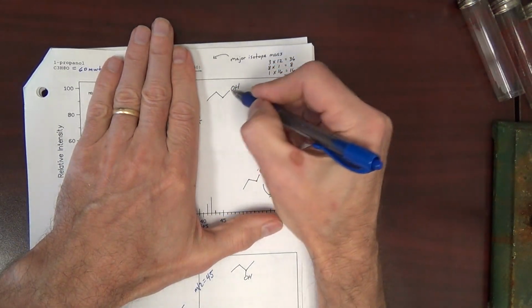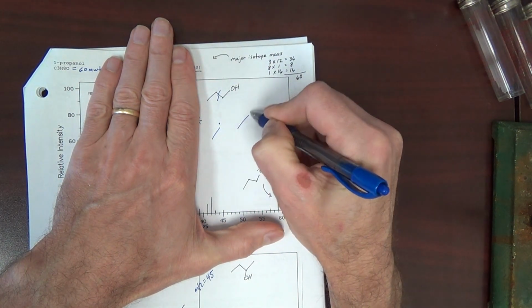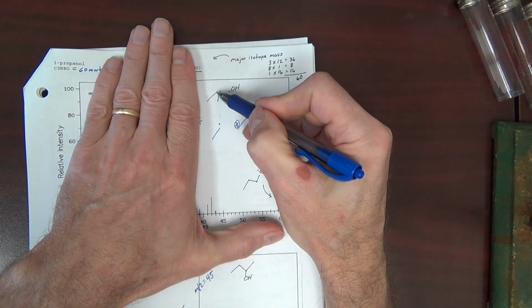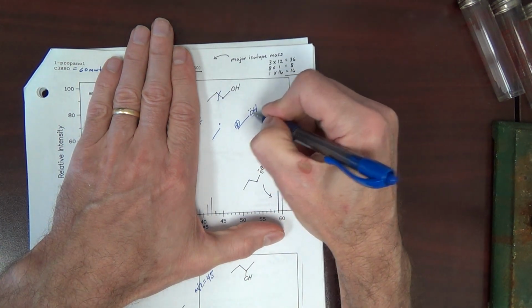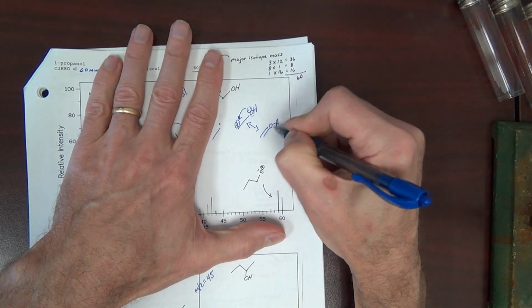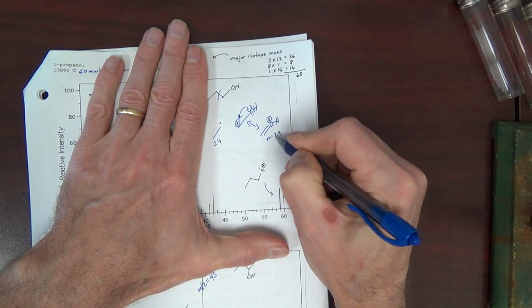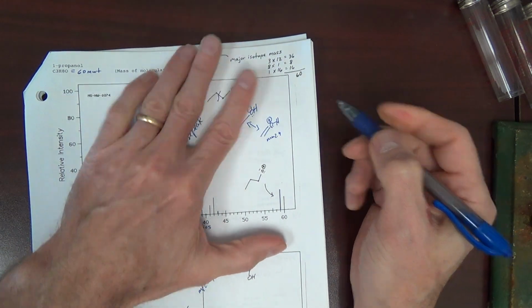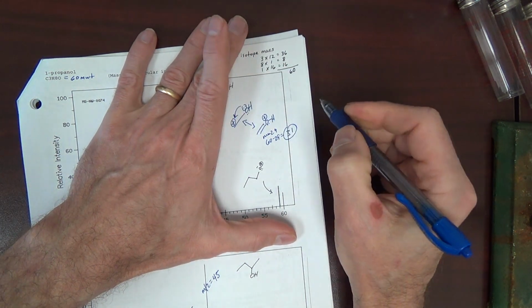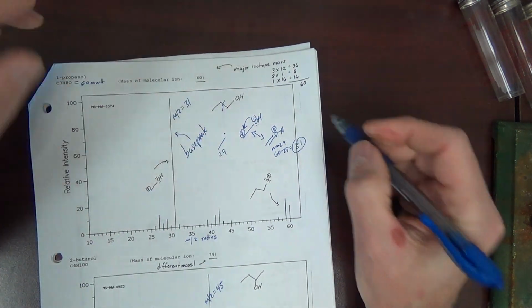For this compound, where do we expect to cleave? I would expect to cleave here to give this radical plus this cation. I would call that alpha cleavage because it's between the first and second carbon from the functional group. Why is this good? I can do resonance here, and I can get this. This would be 29, so this should be M minus 29. The mass is 60, so 60 minus 29 should be 31. We expect a peak at 31, and indeed we do.